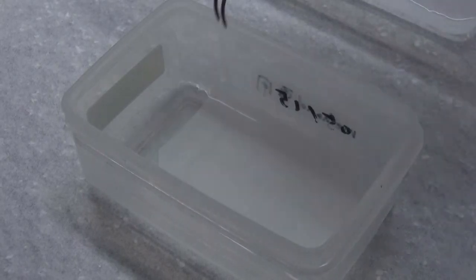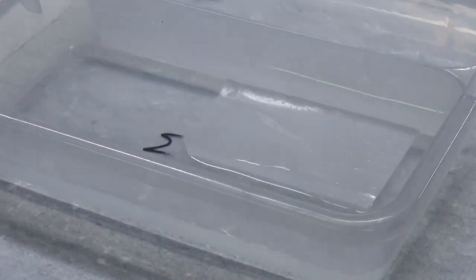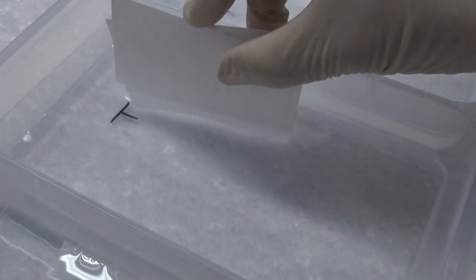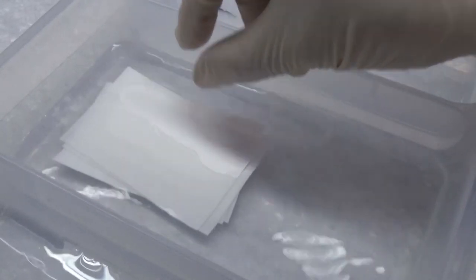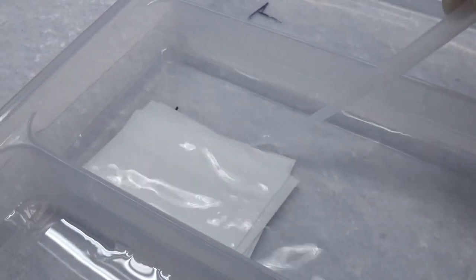Pick up the membrane and put it into one of the transfer buffer chambers to soak for more than 10 minutes. If the membrane floats up, gently press it down with a plastic pipette to ensure complete immersion. Arrange the eight pieces of 3M filter paper into two stacks of four, and put the two stacks into the transfer buffer in another chamber to soak for more than 10 minutes.